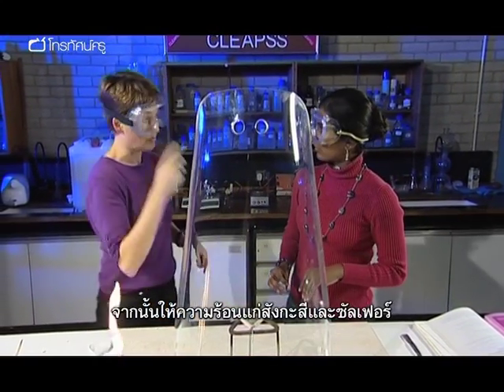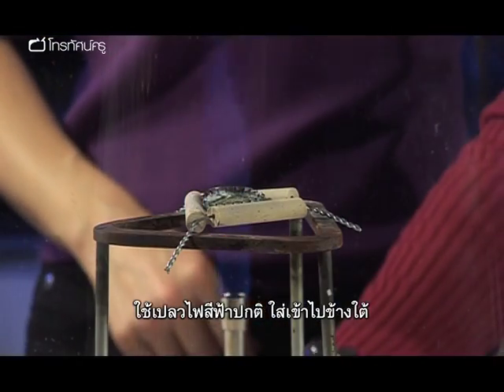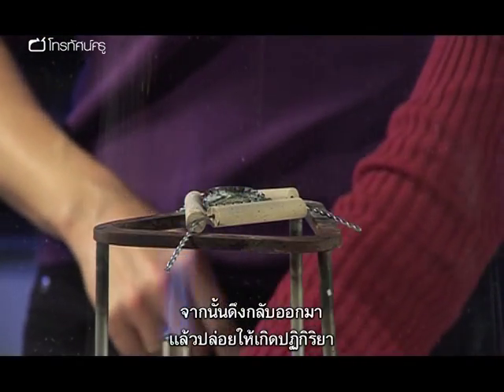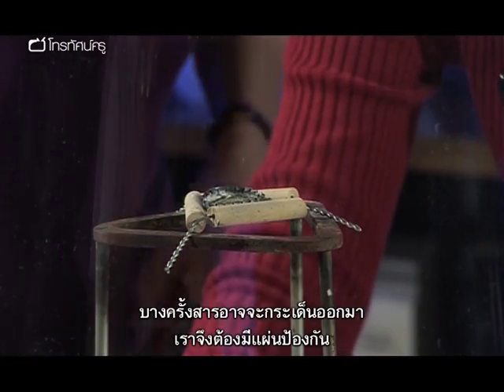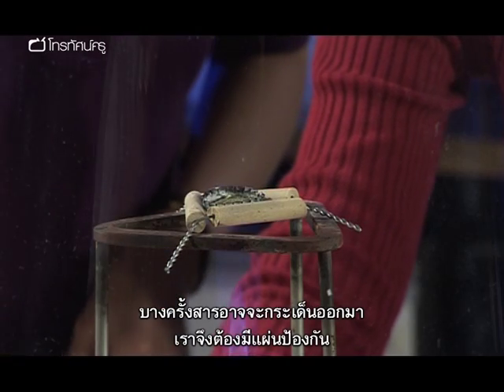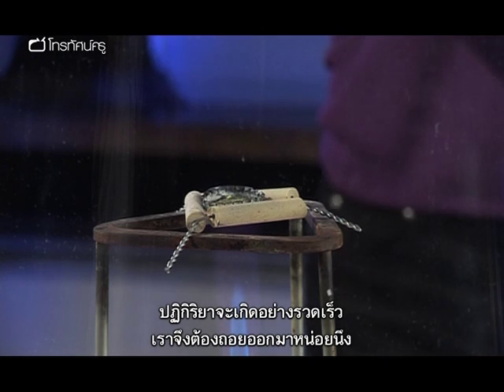And then we just need to heat up the zinc and the sulfur, with a blue flame as usual, put it under, and then we can just take a step back and leave it to react. Can I ask why we have to take a step back? It can sometimes spit out a little bit, which is why we've got the screen. It should get going quite quickly, so if we just take a little step back.